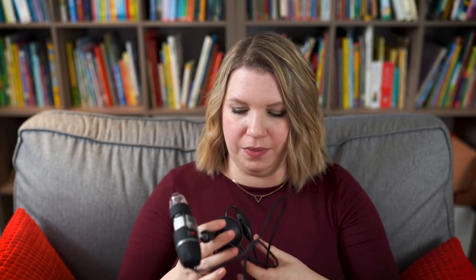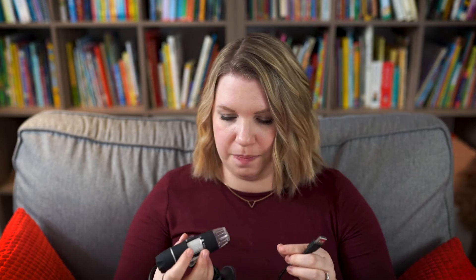Typically we use this guy. It is a digital microscope — we hook it up to your computer and it is a great microscope. It has a thousand times zoom, which is fantastic. It's very clear, it's super nice. However, it is definitely not super kid friendly, because you need to get a laptop, you need to hook it up, you need to get into the applications, and it is very precise. It does require an adult's help to really work with this microscope.